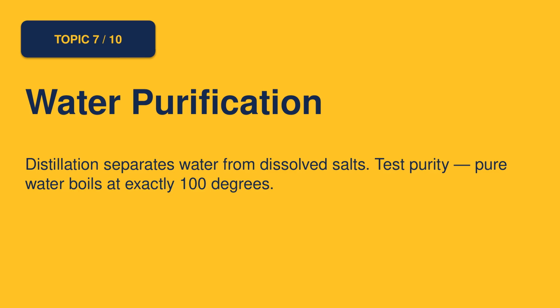Distillation separates water from dissolved salts. Test purity. Pure water boils at exactly 100 degrees.